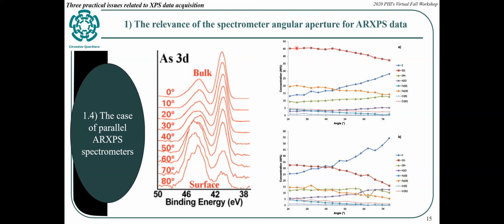Here is every 3 degrees. This is this measurement. So there are too many angles here. You don't get more information by giving more angles here. So what they actually need to do is to average maybe every 3 points to get much better data.